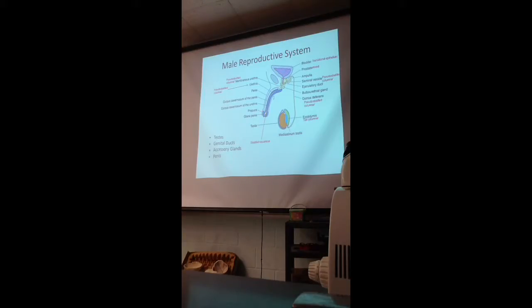When it comes here, it's pseudostratified columnar in the urethra, in the main penile urethra. And at the tip of the urethra, it's stratified squamous. Right? Any questions regarding types of epithelia? This is where you'll be getting confused, so just make sure you identify the different types of epithelia.